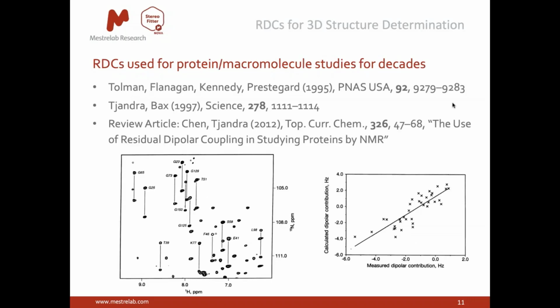Turning to residual dipolar couplings, Jim Prestegard, while he was at Yale way back in 1995, was probably the first to publish. He looked at myoglobin, which has a high anisotropic susceptibility, which self-aligns in buffered water when placed in the magnetic field. Now, not many proteins have a paramagnetic anisotropy. Most are diamagnetic. So Nico Tjandra and Ad Bax followed up in 1997 with maybe the first of 1,000 papers that picked ubiquitin as its example. Diamagnetic proteins don't self-align in the magnet, so they need help. And that came in the form of DMPC-DHPC phospholipid bicelles.